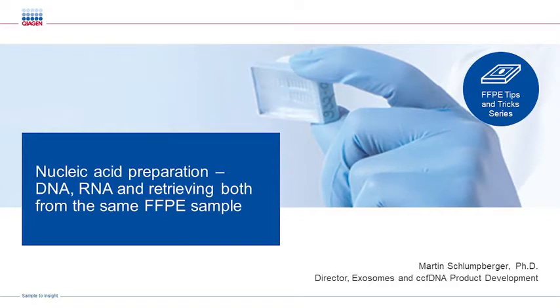The topic of this webinar is isolation of DNA and RNA from FFPE tissue, key considerations, important aspects, and also how to isolate both analytes from the same tissue section.